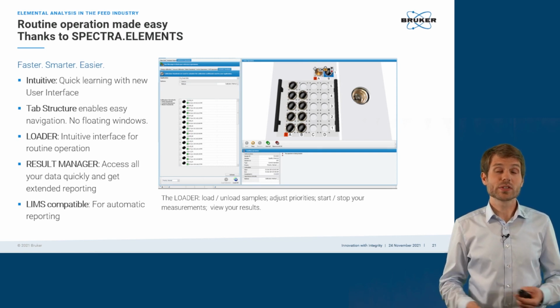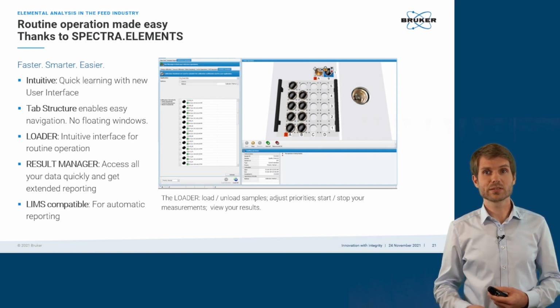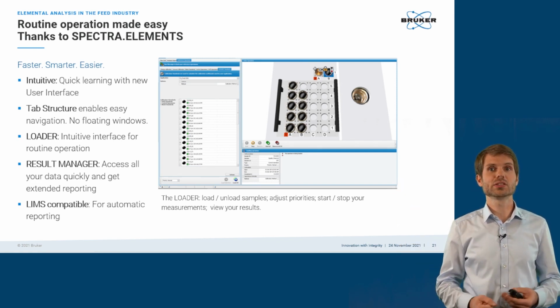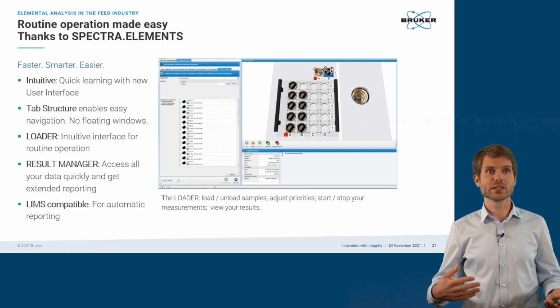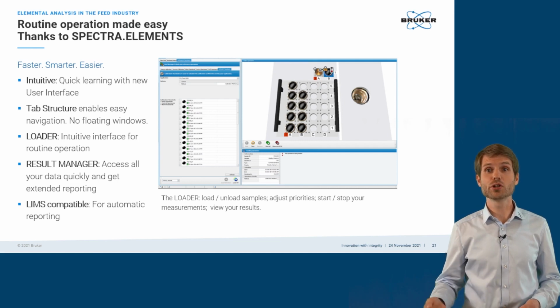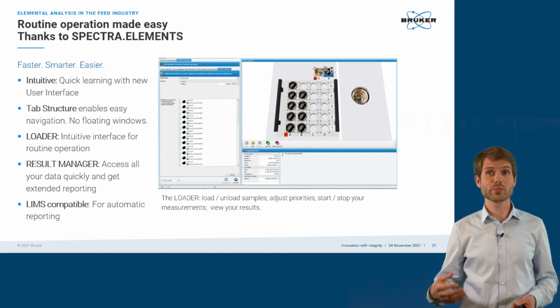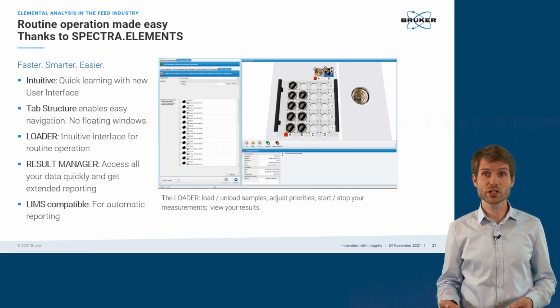Then, of course, once you've calibrated, you might wonder, well, what are the next steps? Is it always like that I need to look into the details of the calibration when I start? No, of course not. Once you calibrate it, you have your solutions, you have push buttons, and you just operate the machine. So once you calibrate it, you're calibrated. There's no need for recalibration of the equipment.